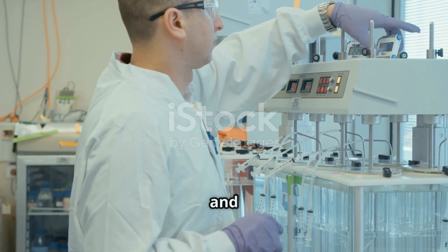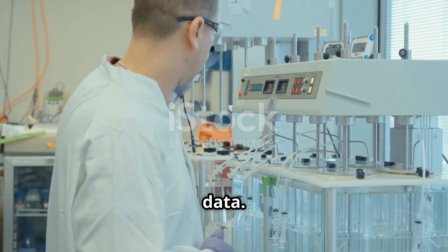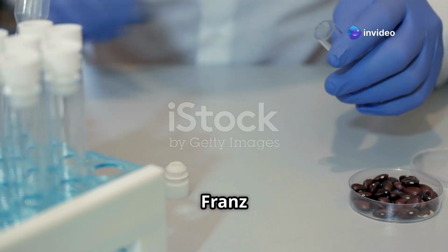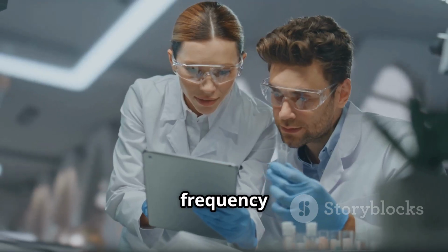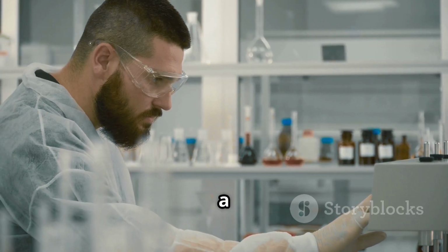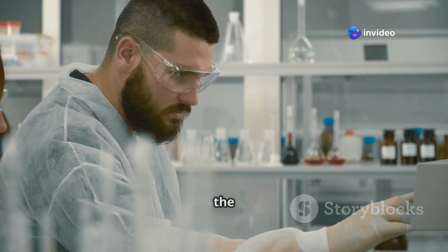Choosing the right time points and speed for an IVRT study is crucial for obtaining meaningful data. The time points determine when we collect samples from the receptor compartment of the Franz diffusion cell. These samples are then analyzed to determine the amount of drug released over time. The frequency of sampling depends on the drug's release profile. For example, a fast-releasing drug might require more frequent sampling in the initial hours of the study.